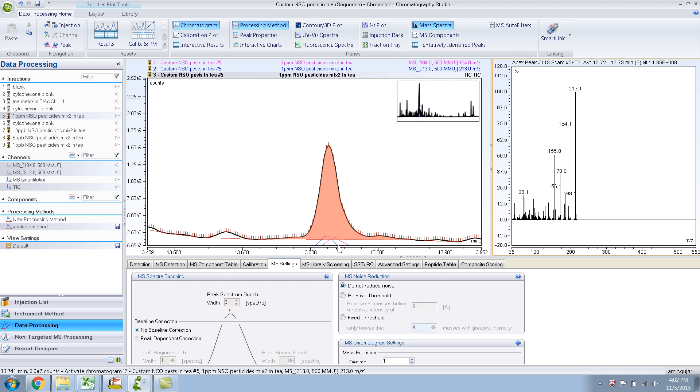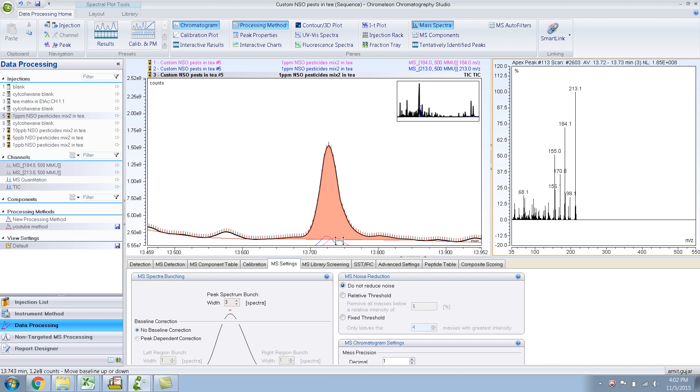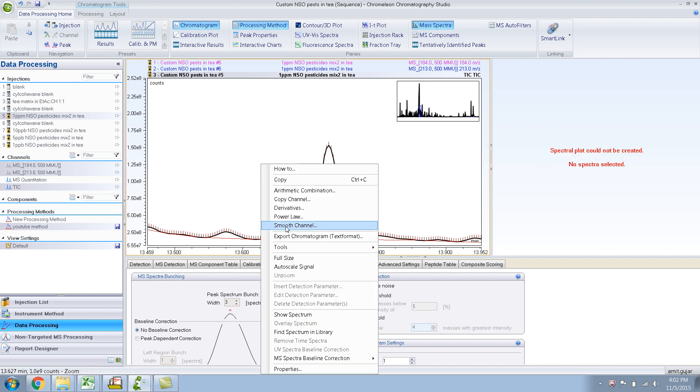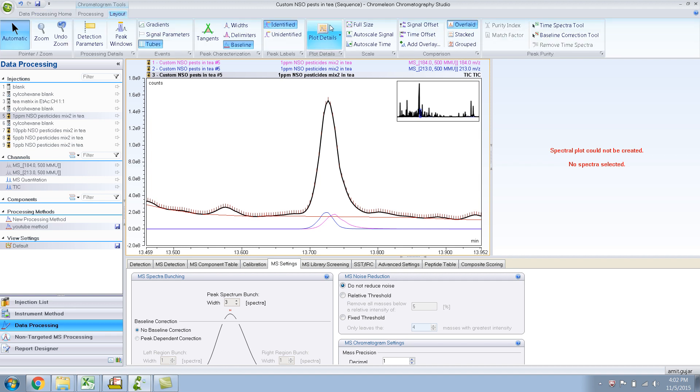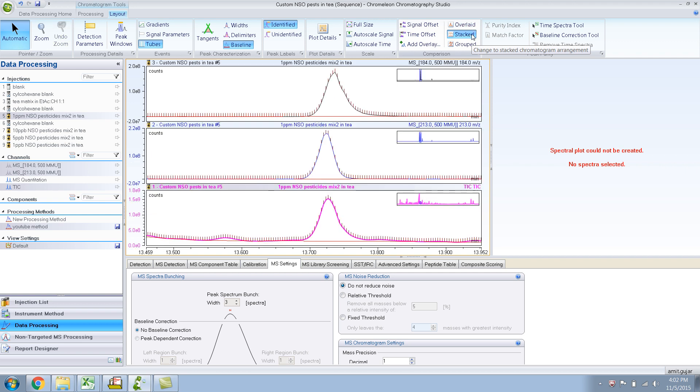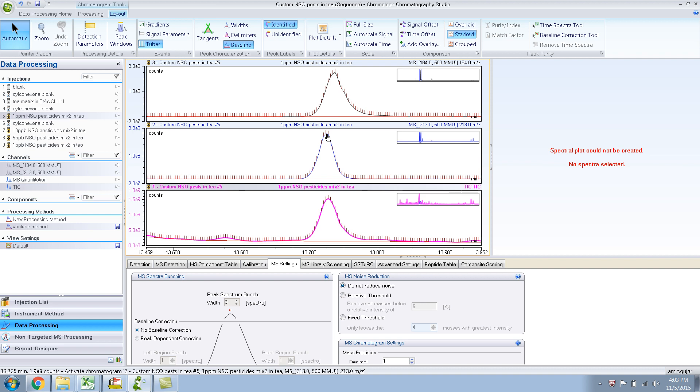So let me just make this window a bit bigger. So it has extracted. Now let me make it overlaid, but let me do this - autoscale, there you go. And let me make it stacked. So you can clearly see that 213, this is 184, this is 213, and this is the TIC, the total ion chromatogram.